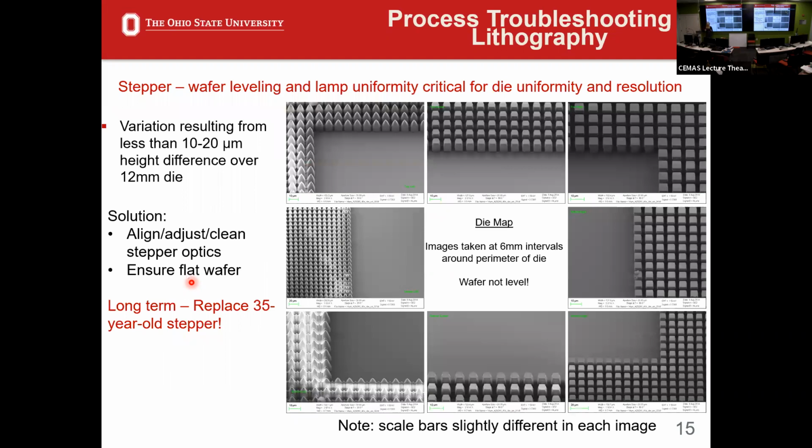I love this. I actually didn't see this before. I was putting this talk together a couple of weeks ago, and I came across these images, and I was like, these are amazing. This is a cross section from one die, and they're mapped out just like they are on the die, or on each of the die. So you can see the upper right is what we're looking for: a bunch of really small squares. I think they're 2 micron gaps, or 2 or 4. Pretty small, and they need to be completely open.